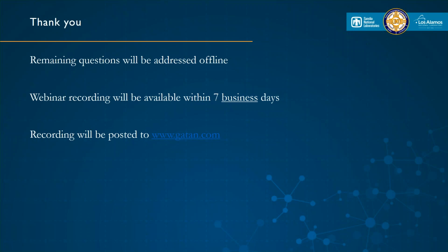I mean, first off, I felt that that would kick in well before any damage. My experience with the CETA camera, I guess, is where I'm coming from, that would kick in and retract the camera well before I thought I had done any damage to it. Then you can do gain correction and things like that and remove any type of artifacts. But I'm not sure I saw any artifacts in the sensor at all. So that was really nice.